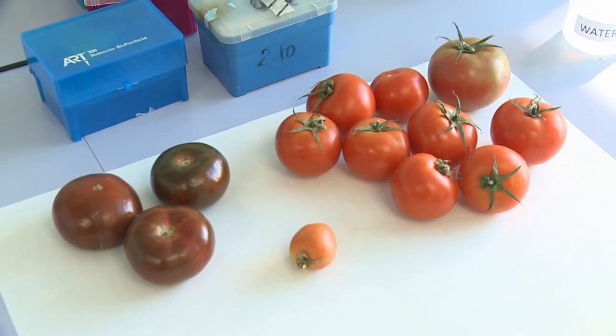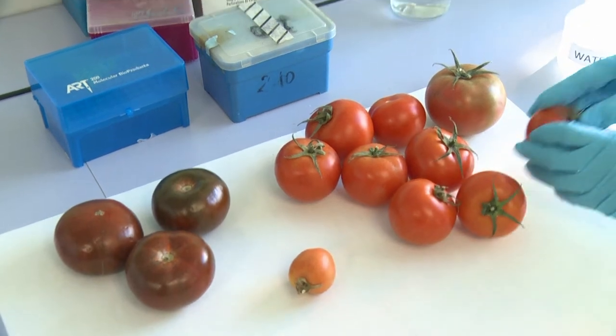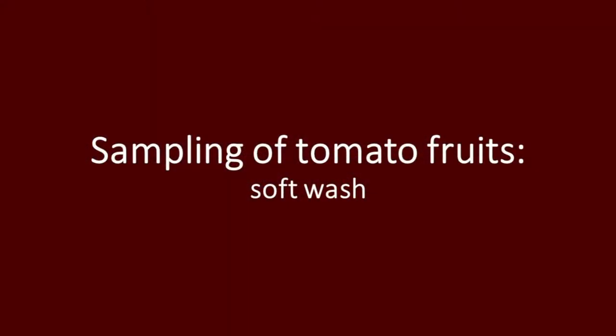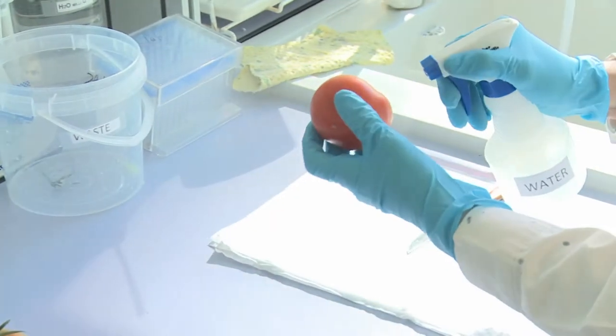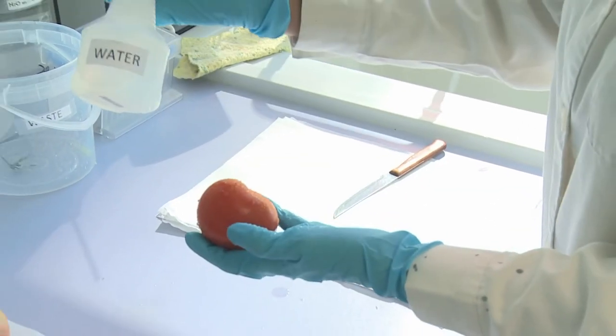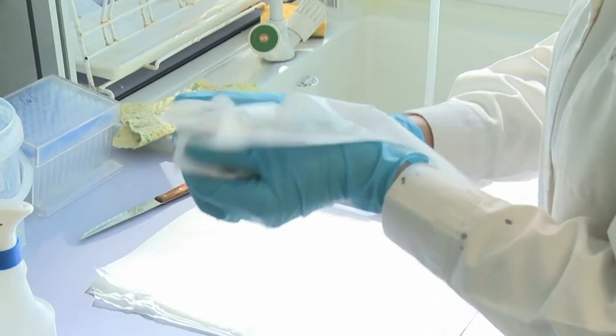Firstly, take the ripe tomato fruits from the plant with great care to avoid any physical damage. Besides, clean the fruit surface with deionized water and carefully dry with a paper cloth.